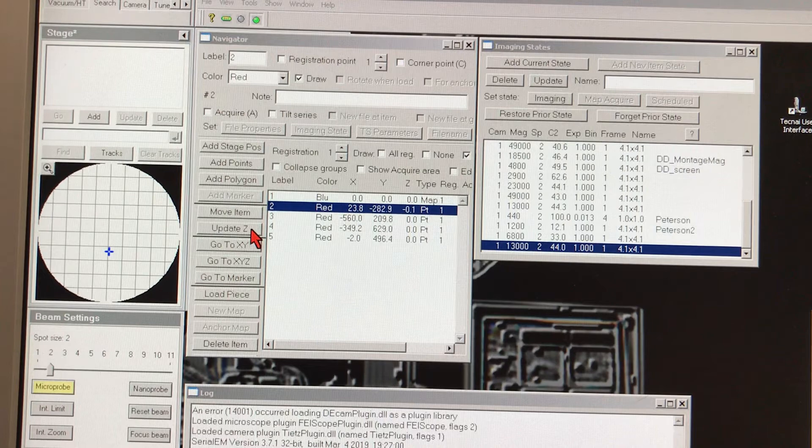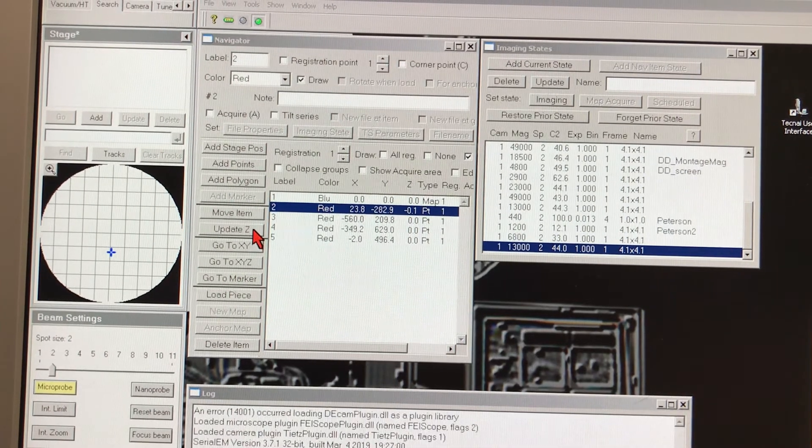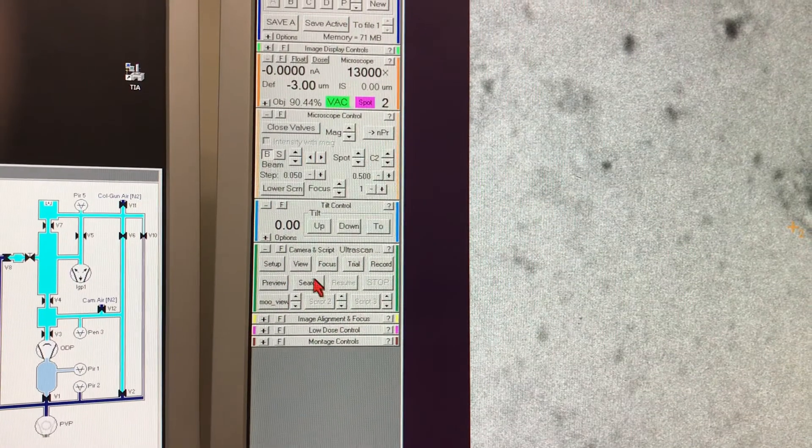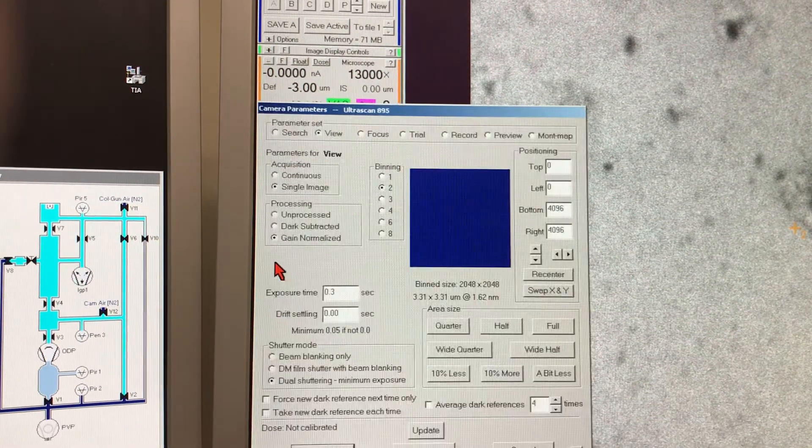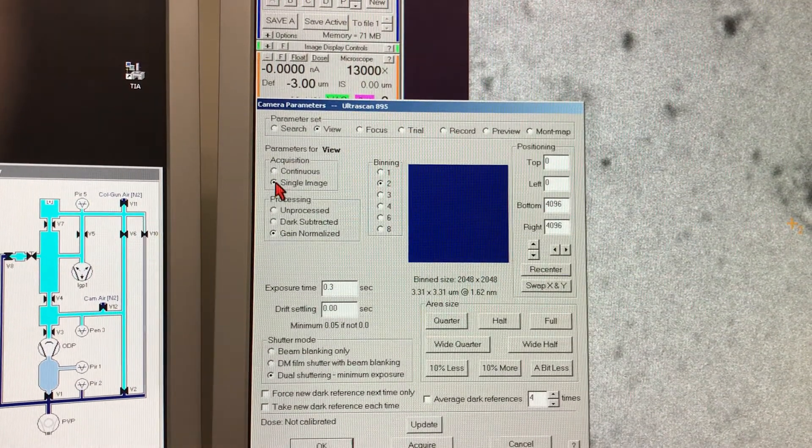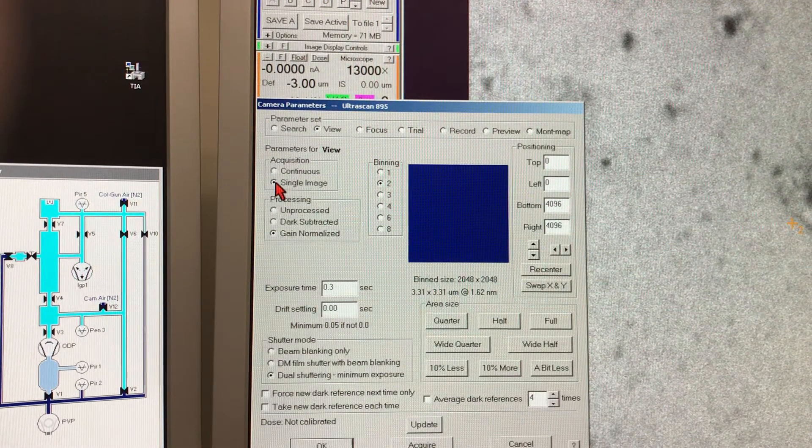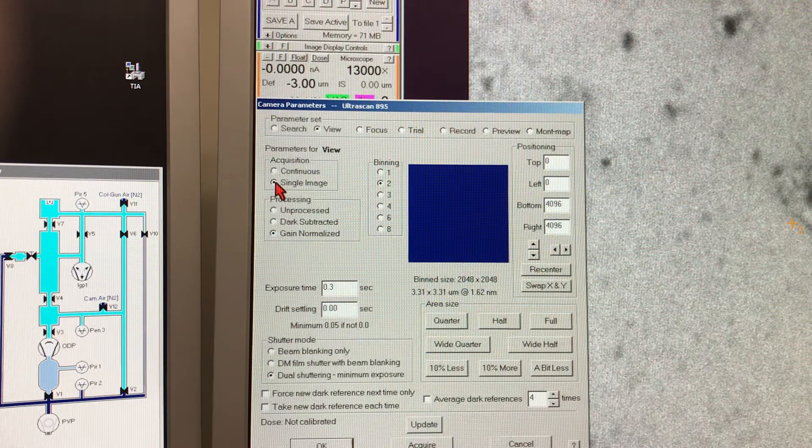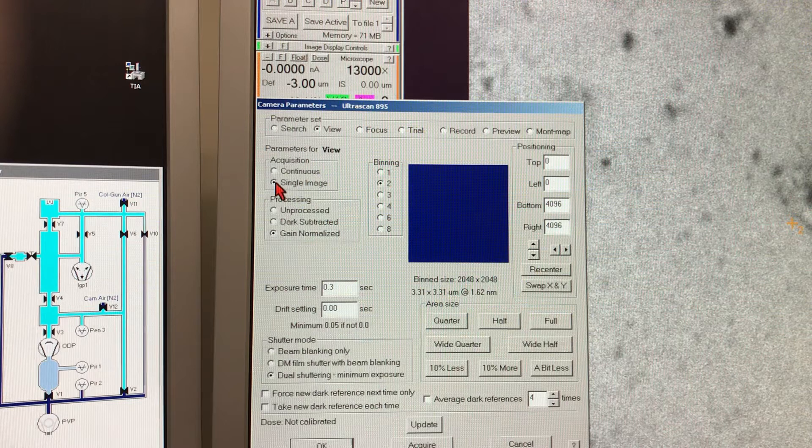Before we take a view image, it is very important to set up the viewing parameters. At this point we would like to set the image acquisition in single image mode and not in continuous mode. The difference between both of them is that one is going to give you a still image and the other one is going to give you a live view of what is happening at that position.